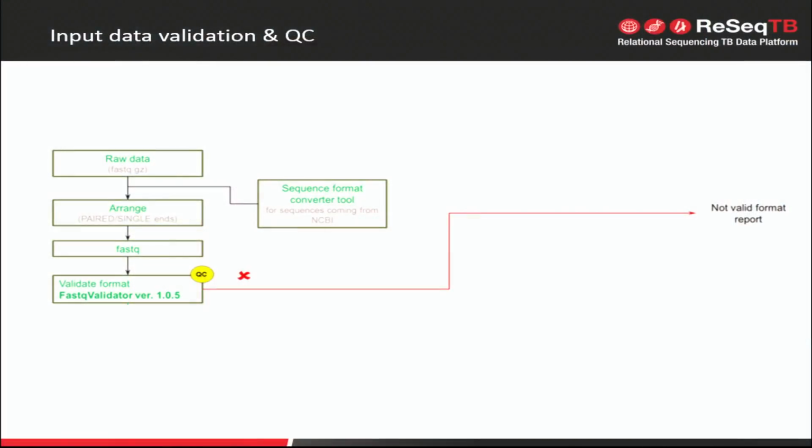So for the input, the first thing we're starting with are what I call FASTQ files. These are the raw sequencing files coming off of the Illumina platform, and all the data we've looked at today has been Illumina based. We're getting a lot of the data now from NCBI through the SRA, and through contributors, Stefan's group, Derek Crook's group, and others. So the first step is to make sure it is actually a FASTQ file, because that's what's going to feed into the pipeline.